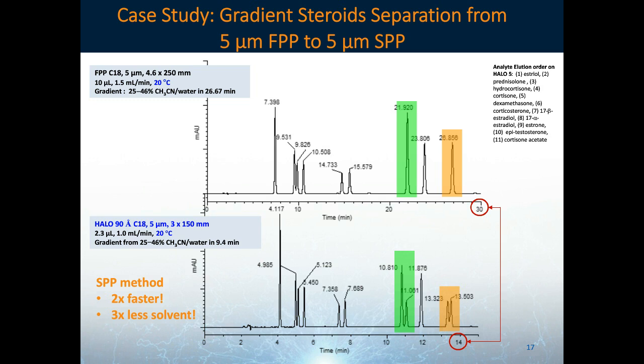So not only are we able to do the separation faster, but we're also able to see some money savings in terms of solvent, both in the use and disposal.